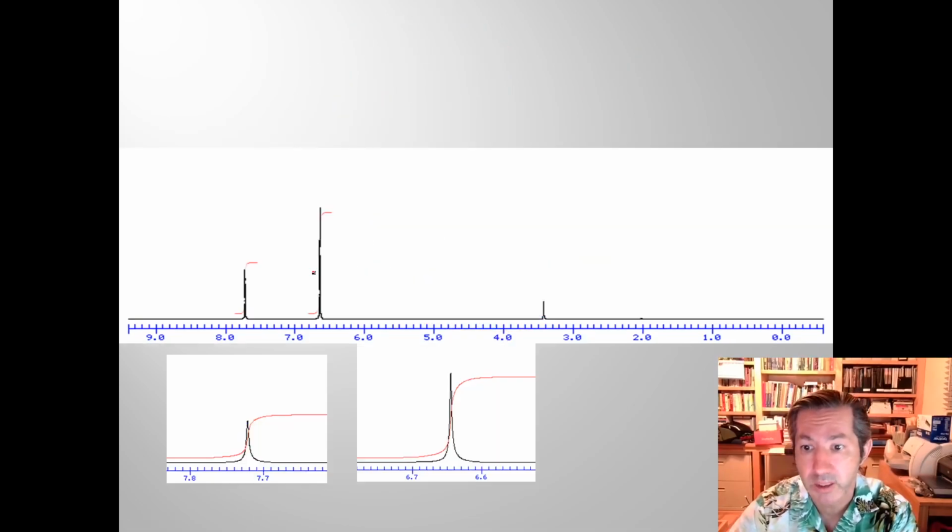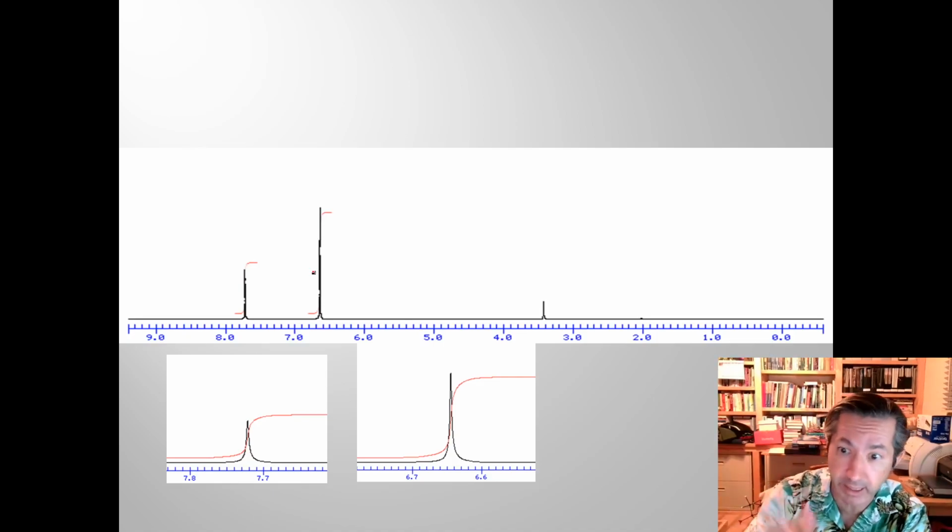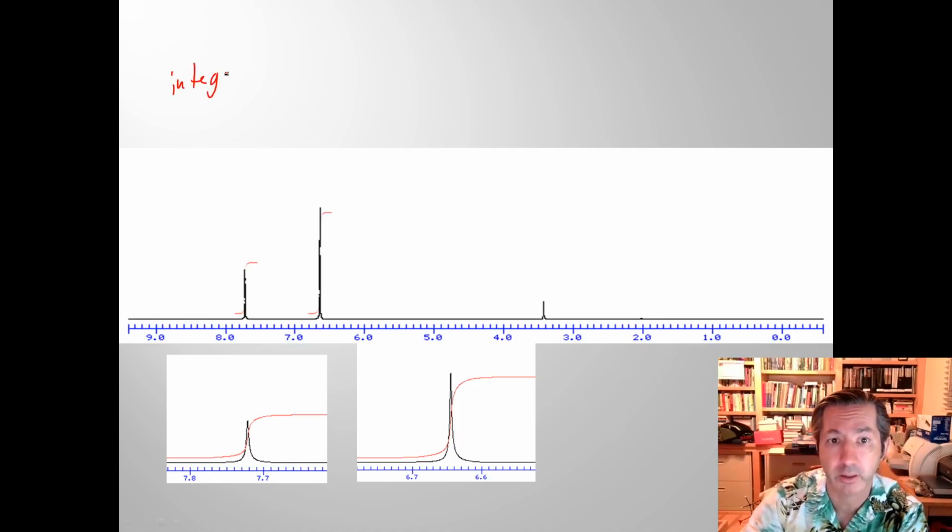Let's look at one more example so we can look at this phenomenon of peak area. And it's sometimes what's called the peak integration because the instrument will actually integrate the area underneath those peaks. And so if you ever hear me talk about the integration of the signals, I'm talking about that peak area.